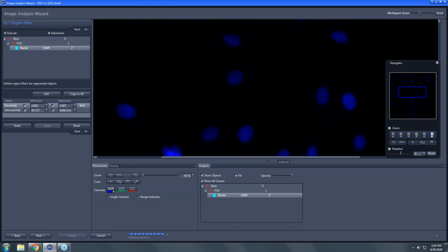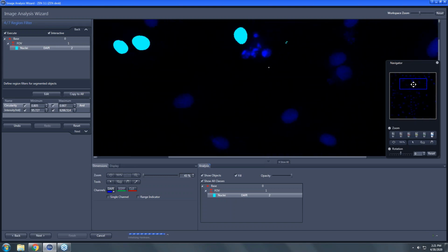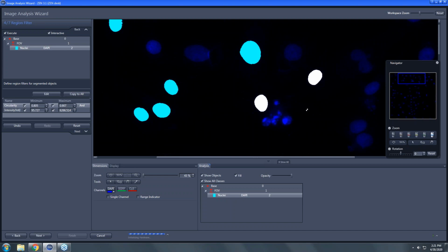Now, if we move around, Nicole, we may not see the analysis because we only did the thresholding on a subsection of the image. So if you're confused as to why some things are not masked now and other things are, that's the reason. We'd have to click back to the thresholding and then come forward again. But it doesn't have a negative impact on the image analysis, so we can just leave it as is. So let's go on to the next step.